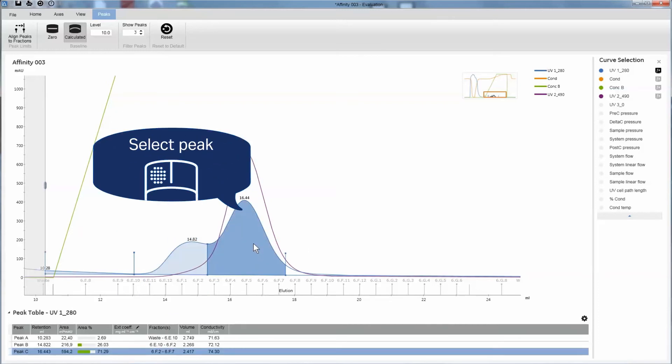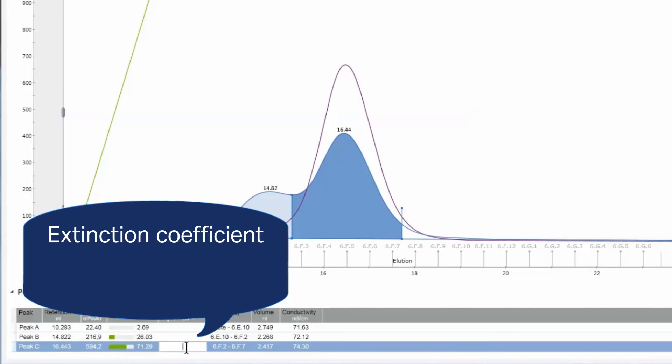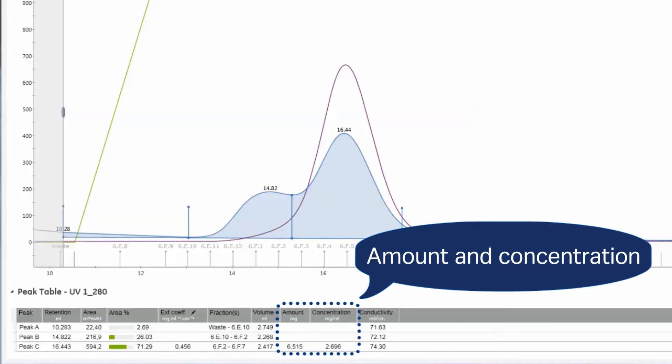It's simple to get the amount and concentration of your target protein. Just enter the extinction coefficient in the peak table, and the results appear automatically.